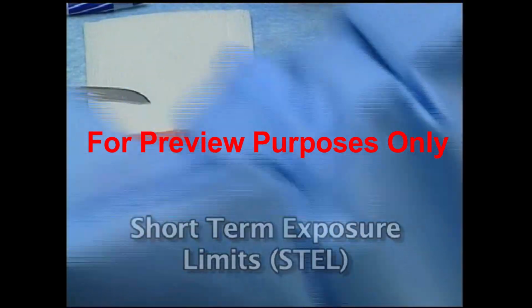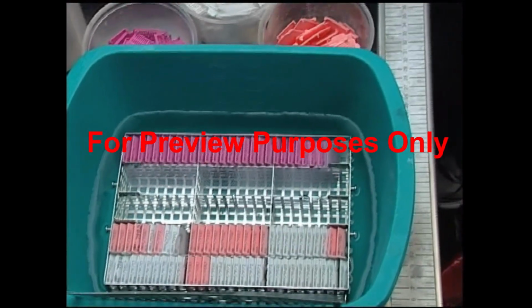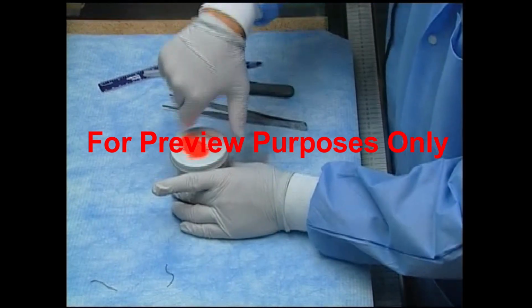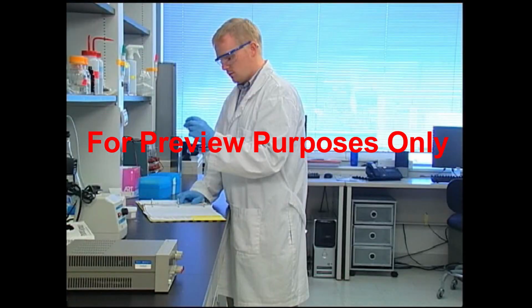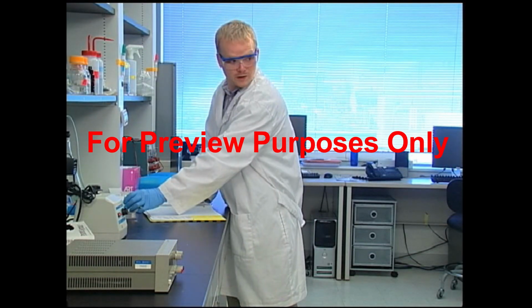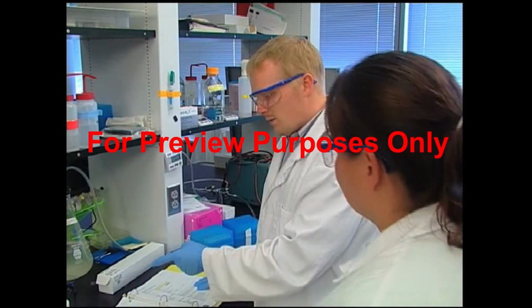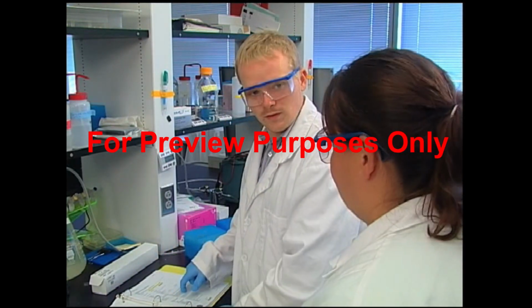These limits are based on an exposure period of 15 minutes. OSHA's short-term exposure limit for formaldehyde exposure is no more than 2 parts per million. This may seem like a lot of numbers, but exposure limits have been set up for your protection. So make sure that you pay attention to them. If you have any questions, see your supervisor.